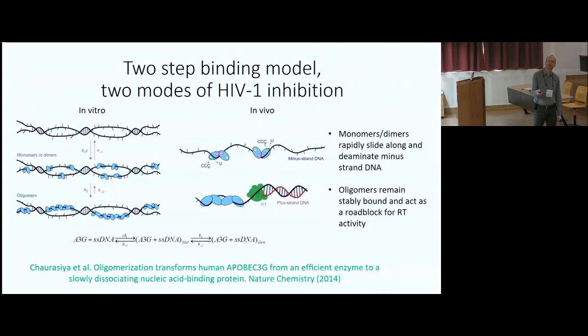And we did show these large oligomers, and what we showed is that we measured the kinetics, and we showed that it starts off in a fast binding state with some bimolecular reaction rate, and then it goes into a slow binding state with some other rate, but we didn't know how big those oligomers were. We're doing a single molecule experiment, so we have one DNA molecule in solution, and you've got Avogadro's number of molecules in solution, and so the oligomers can be as big as they want in our experiment.